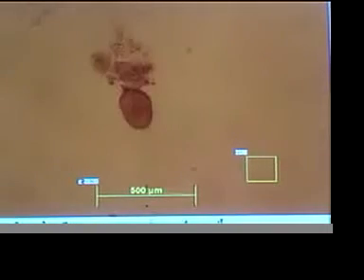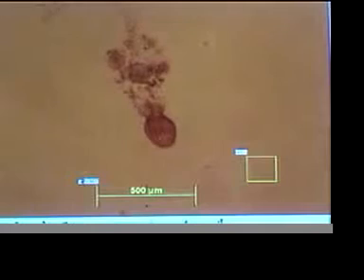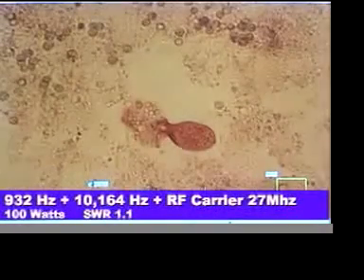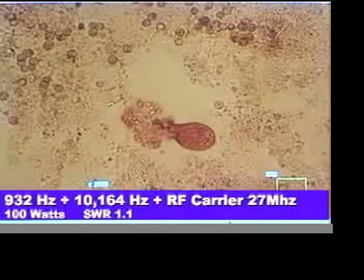Watch carefully, I'm going to keep him centered in the scope. Look at that. Incredible. Now watch carefully. Oh, and look, there he's exploding on the run. Watch him, look at him try to escape. Incredible. Can you see that? Very colorful in the midst of quite a bit of debris.